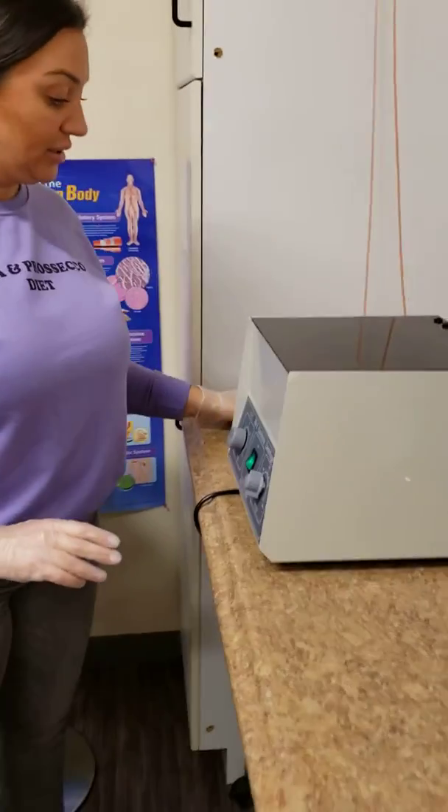So I'm going to fix that, and now I'm going to allow the machine to run for 15 minutes.